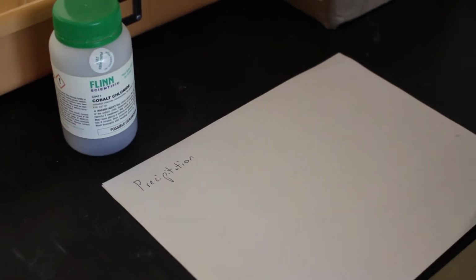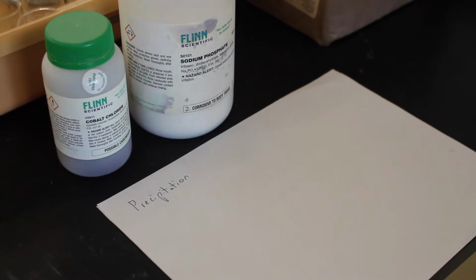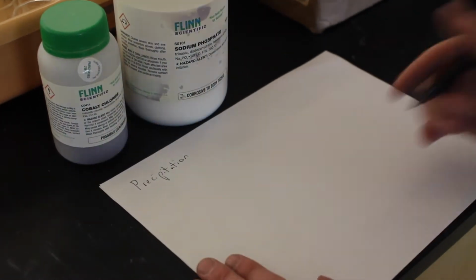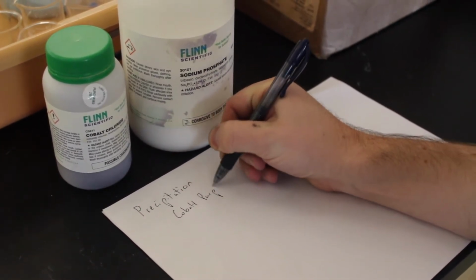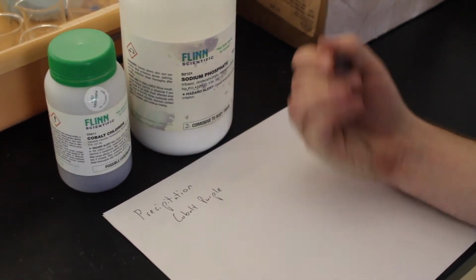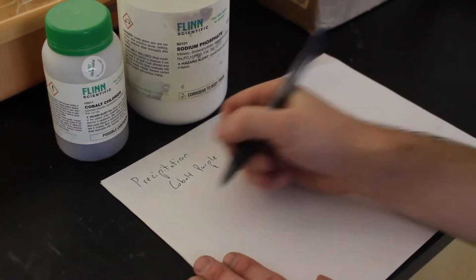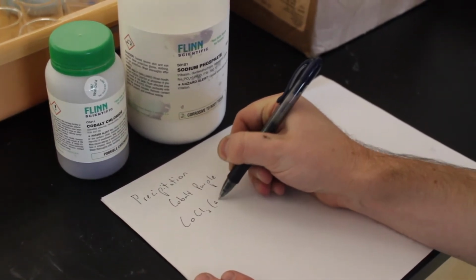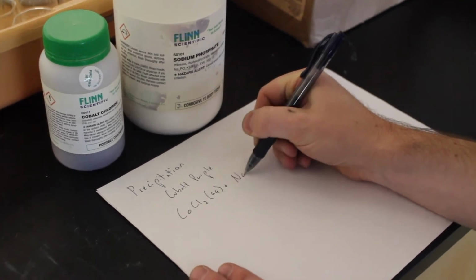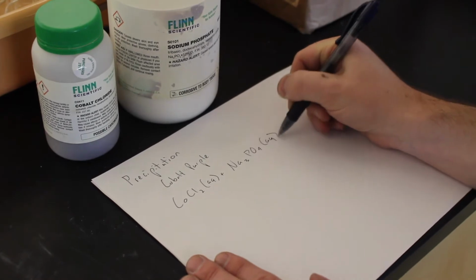So, for example, if we took cobalt chloride and sodium phosphate, put them in some water and mixed them together, we would get a paint color called cobalt purple. And when you do your model, if you're painting, it would look something like this. You'd have your cobalt chloride chemical, which is aqueous, and your sodium phosphate, which is also going to be an aqueous solution.